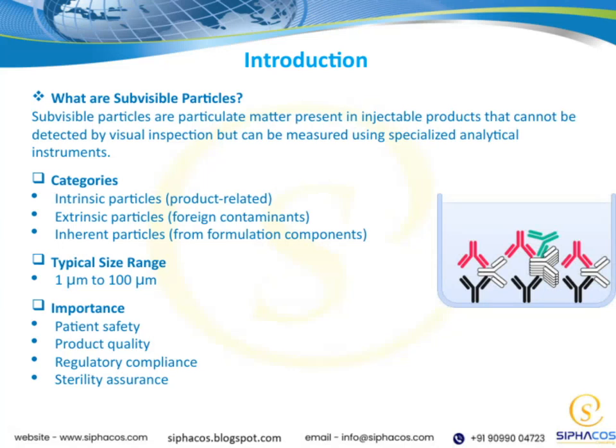Let's start by exploring what subvisible particles really are. These are tiny particles found in injectable products, too small to see with the naked eye, but detectable with specialized instruments. They fall into three categories: intrinsic particles, which come from the product itself, extrinsic particles, which are foreign contaminants, and inherent particles, originating from the formulation components. These particles typically range in size from 1 to 100 microns. Understanding them is crucial for patient safety, product quality, regulatory compliance, and ensuring sterility.